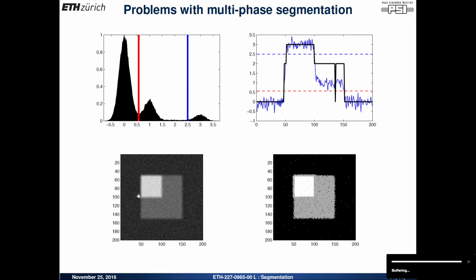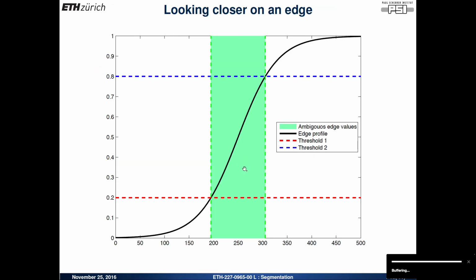I made this model so that it should be high intensity to low intensity, but thanks to the unsharpness in the image, we get this smooth transition. And the segmentation, well, it's tricked out completely, and you get here some film around the object. And that is the one I tried to draw before. And here you also have several pixels within this band, which is ambiguous because we don't know if it's actually belonging to the class or if it's not.